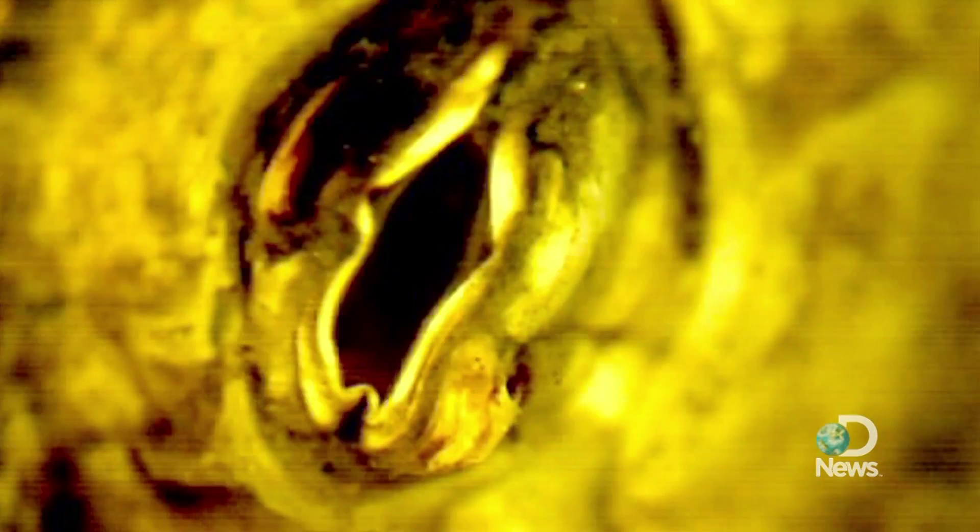This barnacle was actually captured off of the shores of Connecticut, right off of Bridgeport. We're looking at this barnacle magnified approximately 40 times. It's a low-power dissecting microscope that we use to record images of this barnacle.